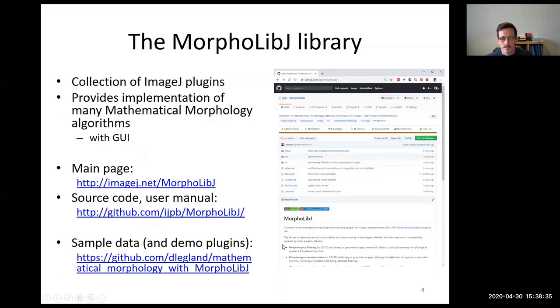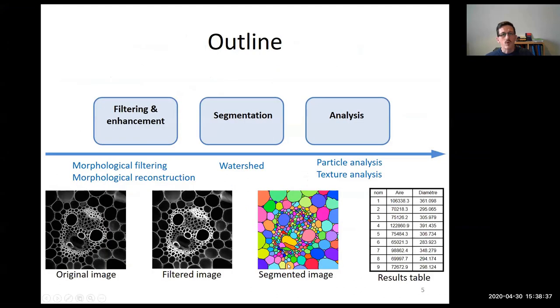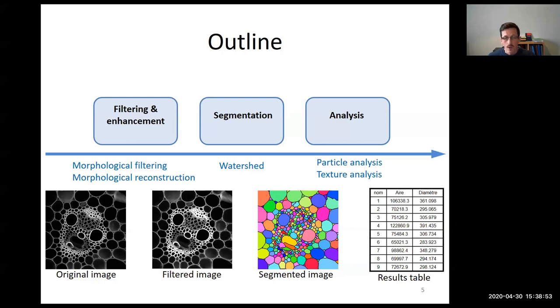Today I will present the global concept of mathematical morphology across three parts of a typical image processing workflow: image enhancement and filtering, segmentation using watershed, and image analysis using MorphoLibJ.